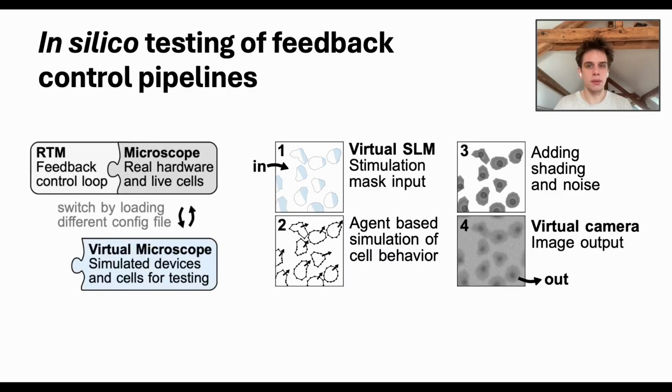These pipelines are very complex, so there's a lot that can go wrong. At the beginning of my PhD, I spent a lot of time going to the lab in the middle of the night trying to fix some bugs because it crashed after 10 hours in or something, because there was something weird that we did not expect. So what was really helpful is to have this kind of virtual microscope that allows you to really probe your smart microscopy workflow in silico.